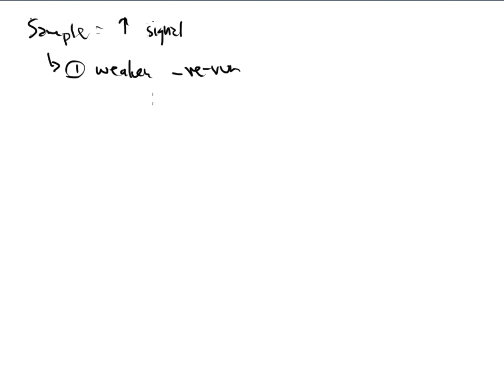So let's say that I do that, and I go into a laboratory. I find this sample that runs really high. It says over maybe on the software, or just extremely higher than the highest standard, and I know there's a problem. So I go back to the wet lab and then I dilute that sample. Let's say I dilute that sample 1 to 10.